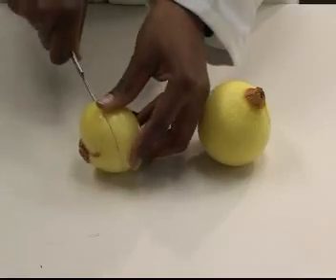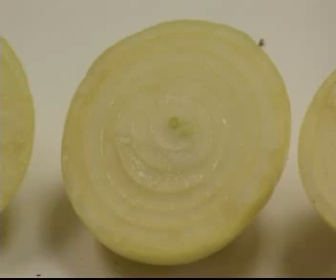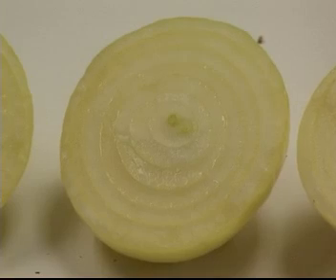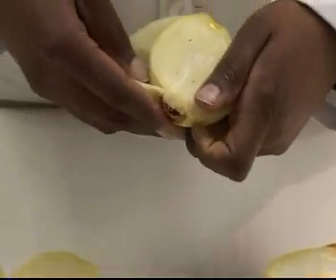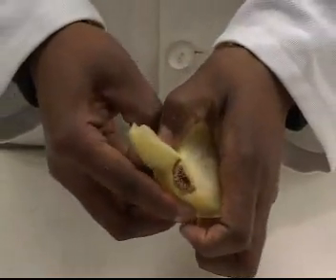Now that you have some idea of how to use the microscope, we are going to show you how to make a slide showing the onion epidermis so that you become familiar with the plant cell and their structures. An onion bulb is made up of several layers of modified leaves. Each leaf has a delicate epidermal layer surrounding it, which can easily be peeled off. This epidermal layer consists of cells that can be easily seen under the microscope.